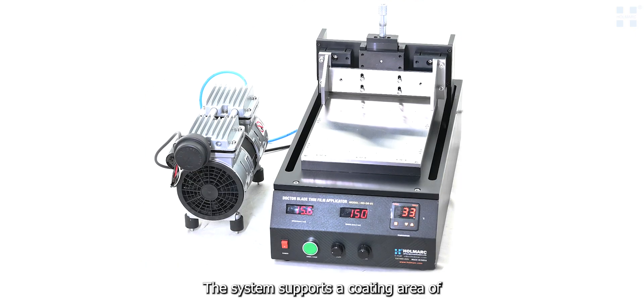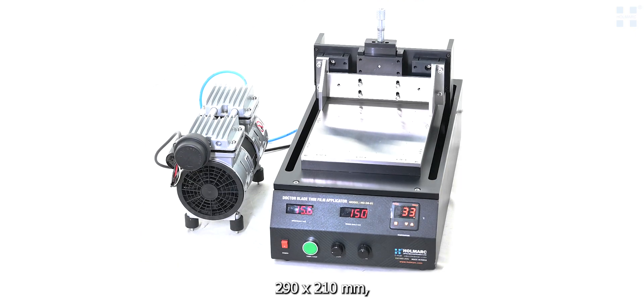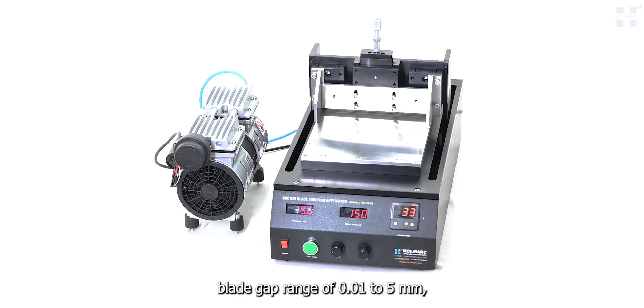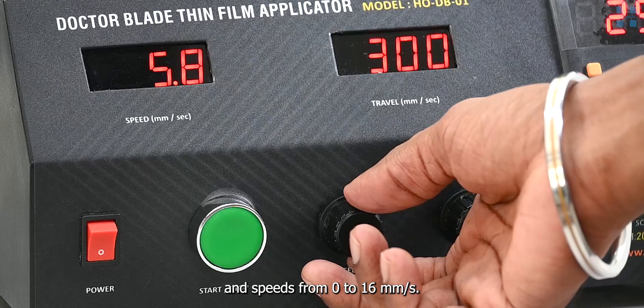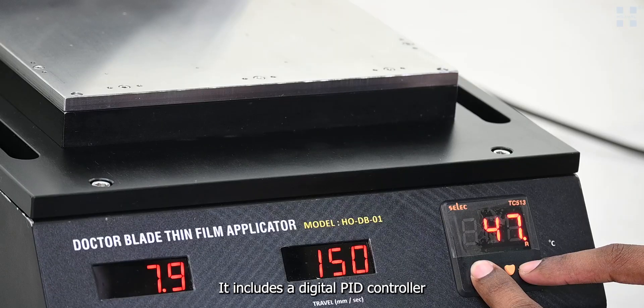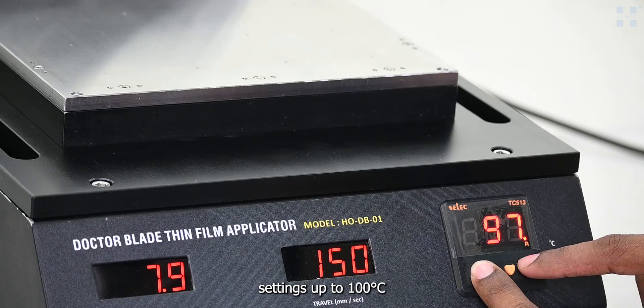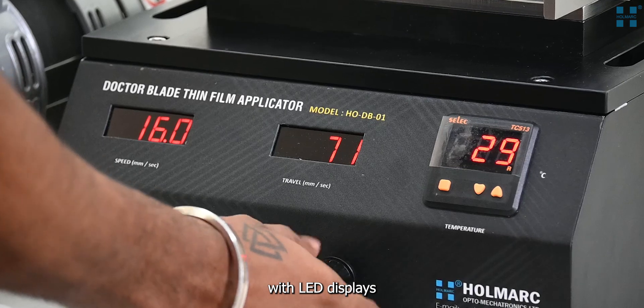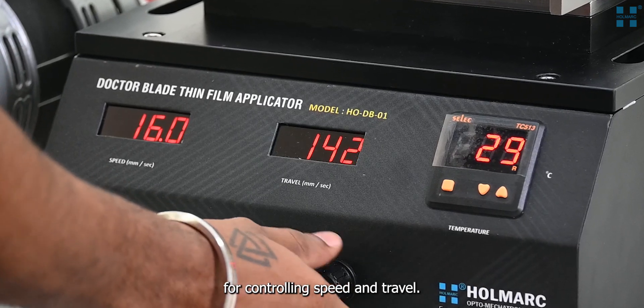The system supports a coating area of 290 by 210 millimeters, a blade gap range of 0.01 to 5 millimeters, and speeds from 0 to 16 millimeters per second. It includes a digital PID controller for temperature settings up to 100 degrees Celsius, and intuitive front panel knobs with LED displays for controlling speed and travel.